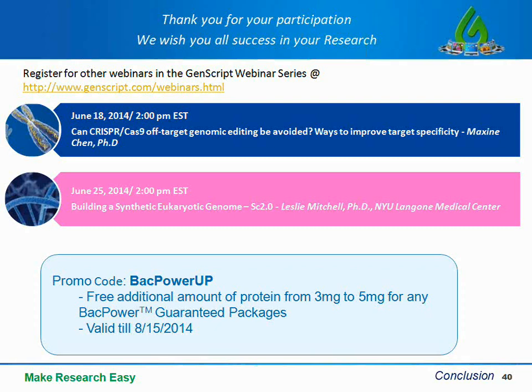Question, my protein is often lost on concentrating using common concentrators. What could be the solution? I have to concentrate at least about 10 mg per ml so that I can use it for my application. With your situation, you can use cross-flow equipment to concentrate the protein. The filtration system can have protein attached to the membrane, and it could be the reason that you are losing the protein during the concentrating step.